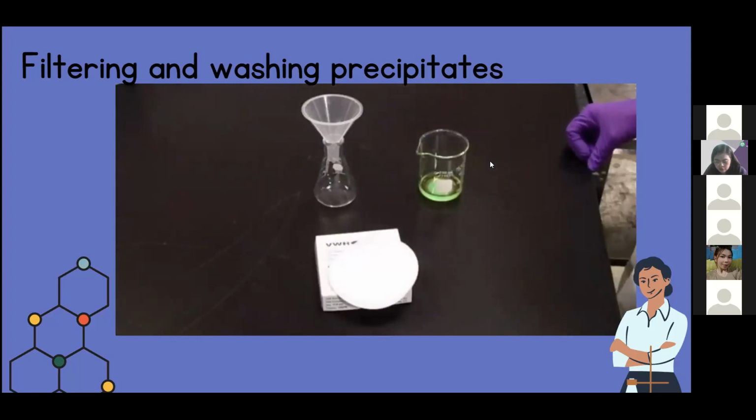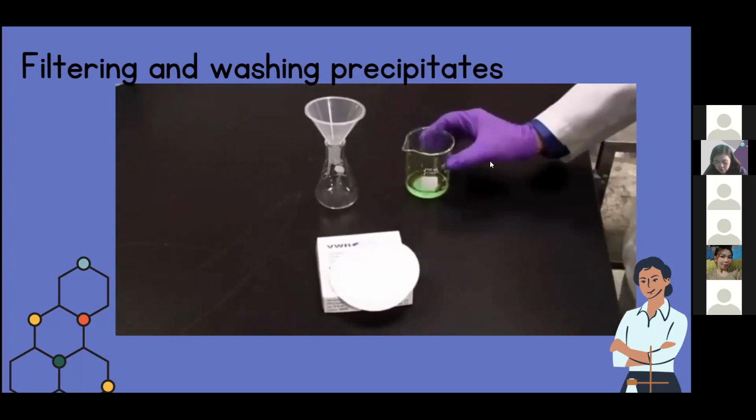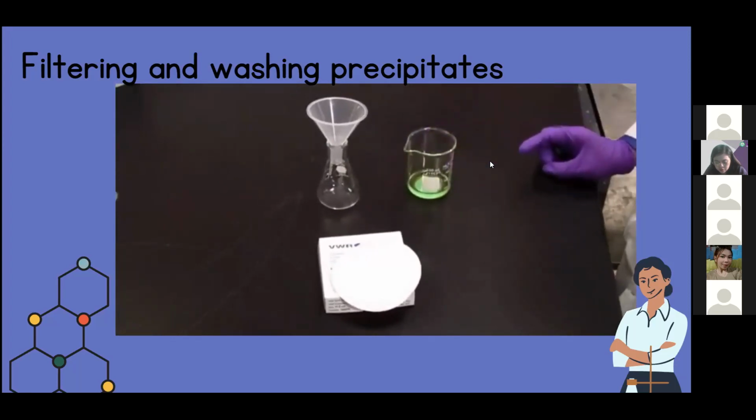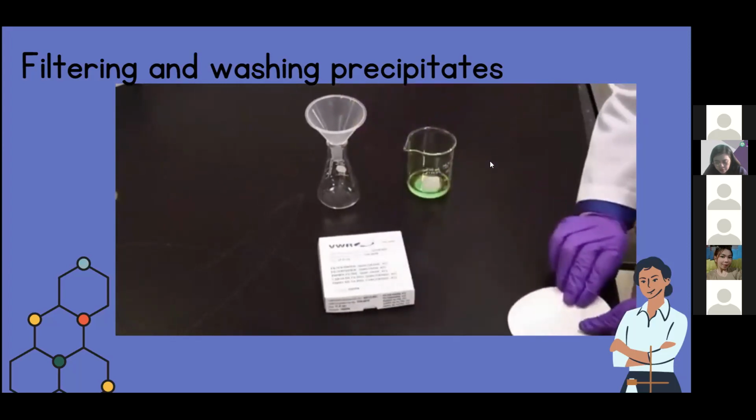There are several methods of filtering. Gravity filtration, which we're talking about today, allows separation with only gravity pushing the liquid through the filter paper. The paper is put into a funnel support, the slurry is poured into the funnel, and the separation takes place as the liquid passes through the paper itself.